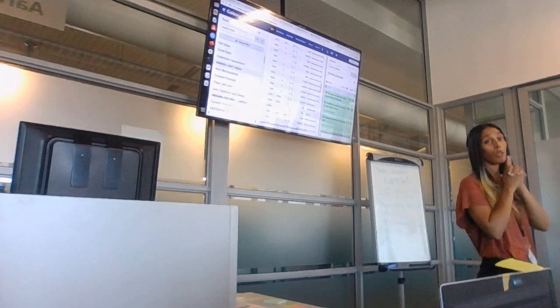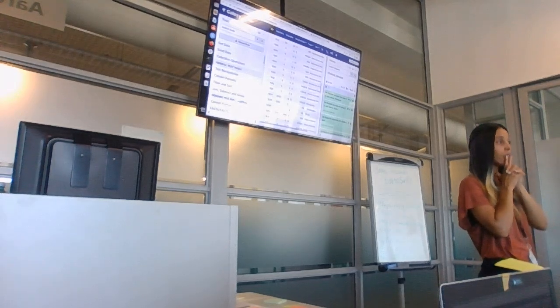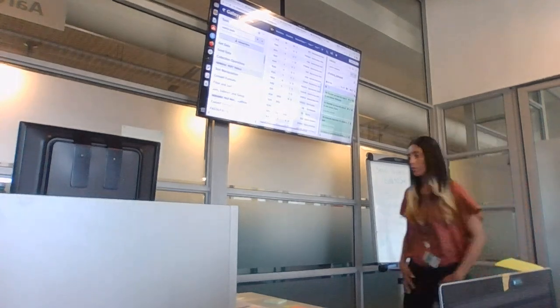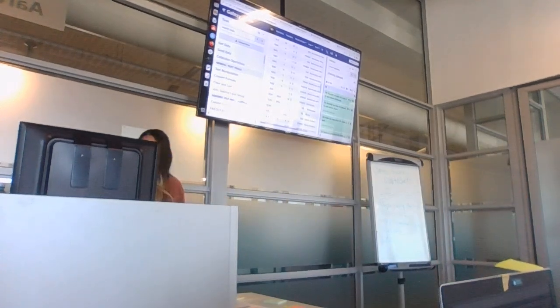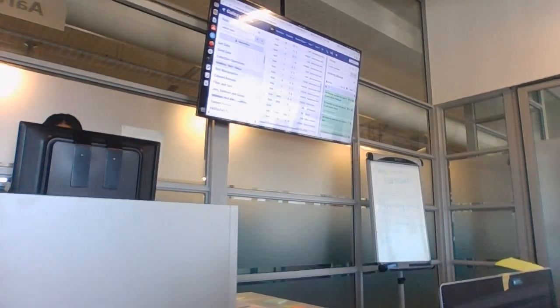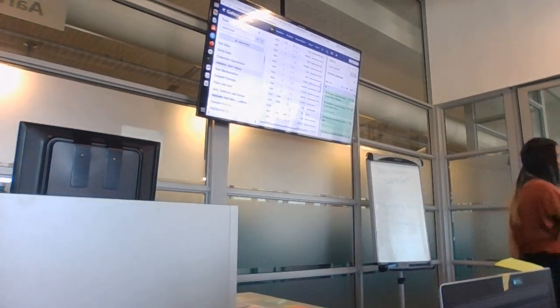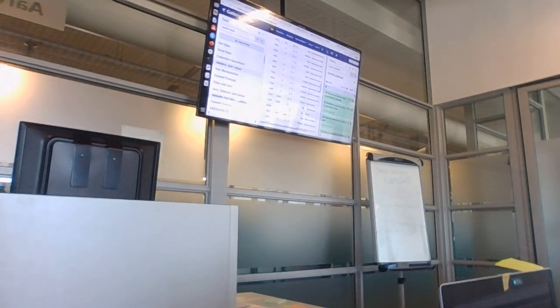You could even go back to the last tutorial to find it. So we want to create a workflow from here. If you can't remember, look at the previous tutorial.